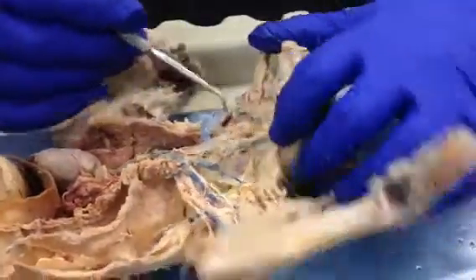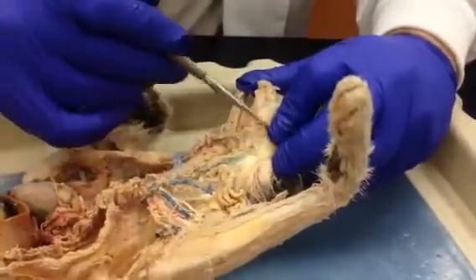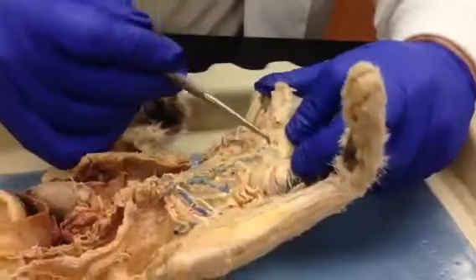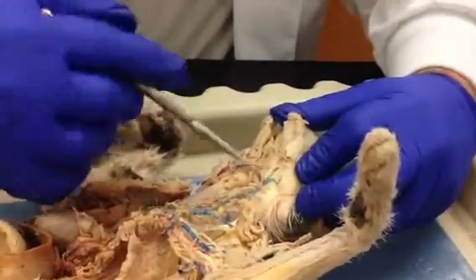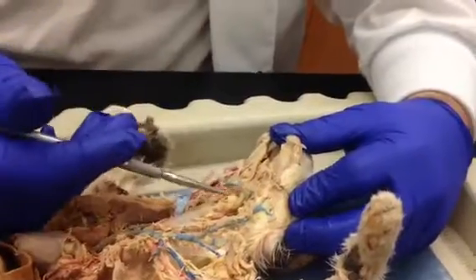As you come up here, again, you'll see this is an area. All you do is, I just remove the connective tissue over the top. Just kind of erase it. And look for the junctures. So just like that. So you're going to have one that goes continuous straight, one that goes back here towards the parotid, and one that cuts across. Now this one we probably have already cut once.